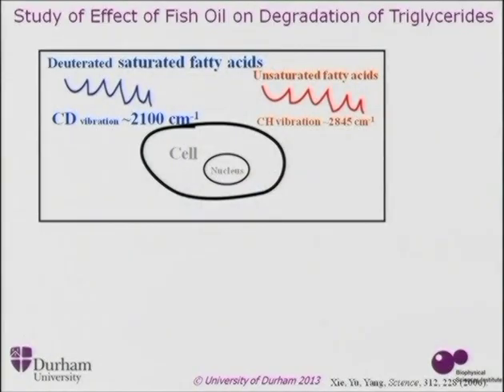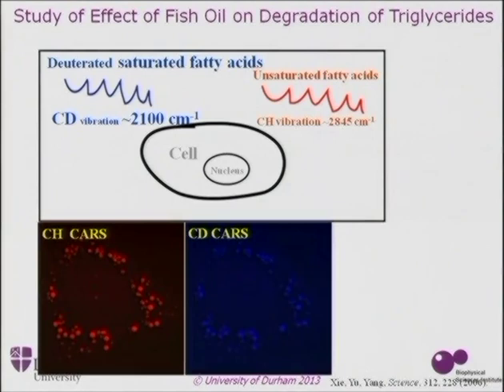So in this particular case, in some saturated fatty acids, you can deliberately put in some acids that have been deuterated, and they have a slightly different vibrational frequency. Therefore you can do an image at one frequency, where the lasers are tuned to one vibration, and one at another, and then slowly you can watch this over time. So for example, you may have put in an external thing to see how it's diffusing in, to see some dynamics that are taking place.